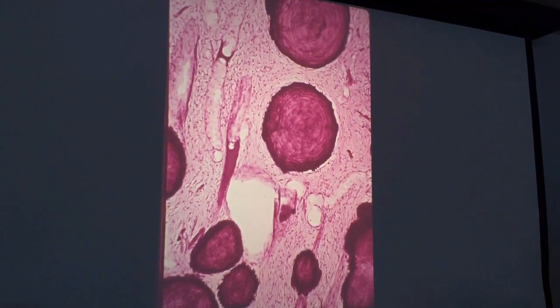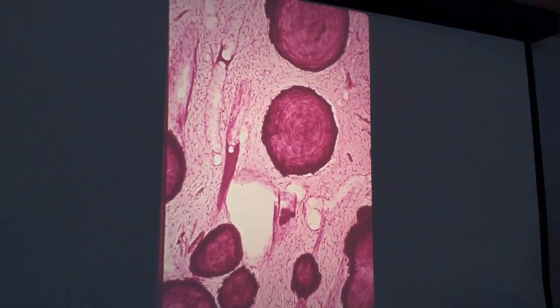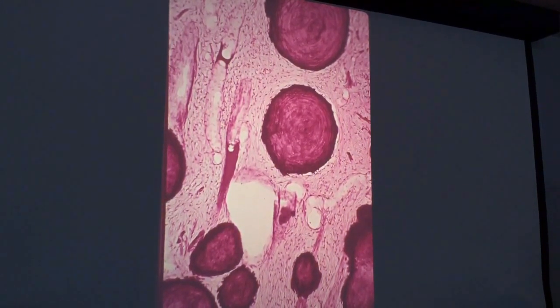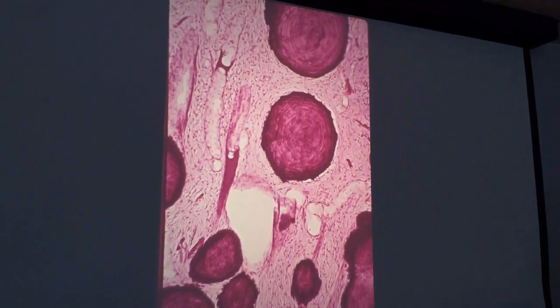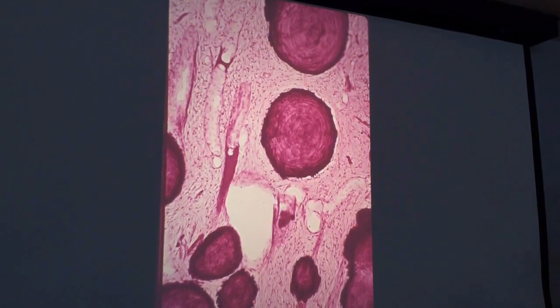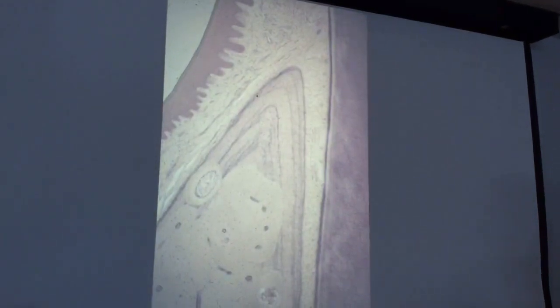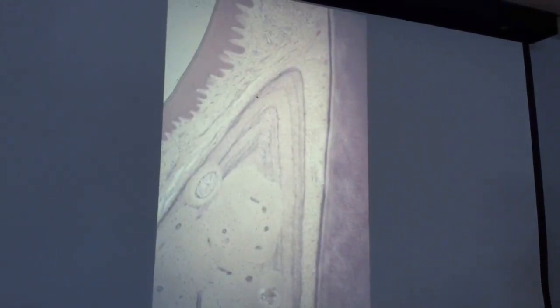How about these? Yeah. Free false denticles or pulp stones. We've also seen attached in the laboratory. I don't think we saw any embedded. But these are the most common. But realize they can be either attached or free, or actually embedded as well. Well, we already looked at that slide. Let's follow the next one here.